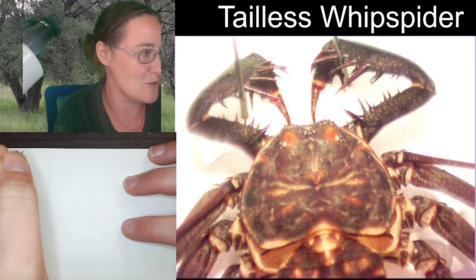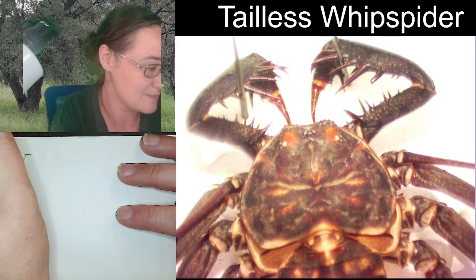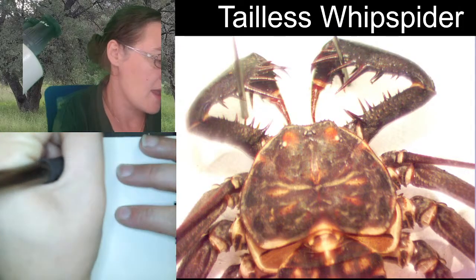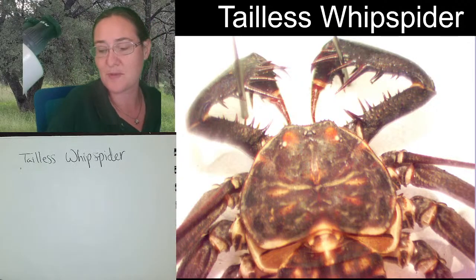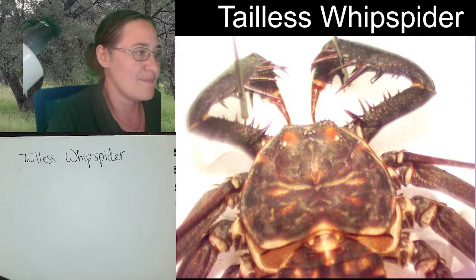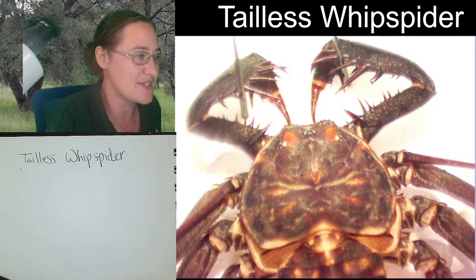We are looking at our tailless whip spider, so I'm going to write that on the top of our paper. Tailless whip spiders like this specimen here are what we call amblypygids. Amblypygids is really the order name for all of these animals.